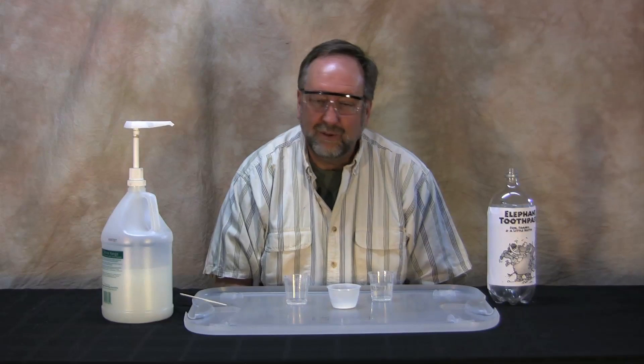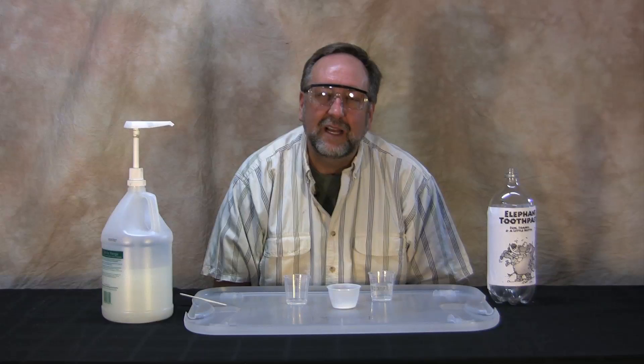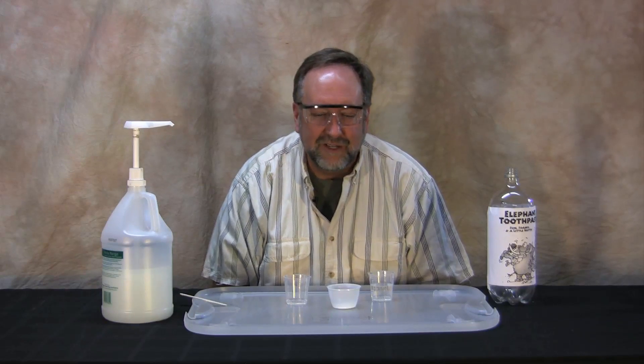This next experiment is called elephant toothpaste. It's a classic chemistry demonstration. It also releases a ton of heat, so it's not only a great chemical reaction, but you can use it as an exothermic reaction demonstration, and it's very, very entertaining.